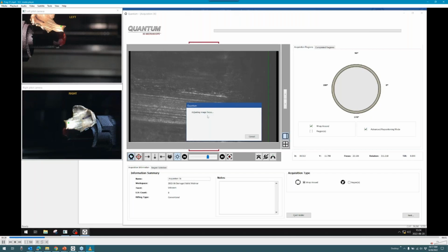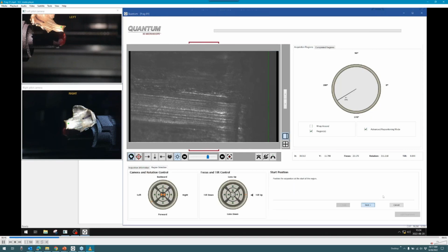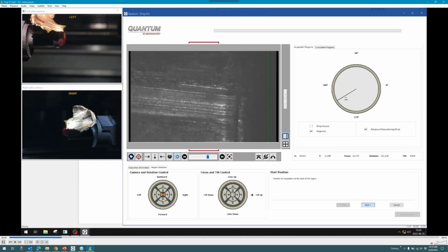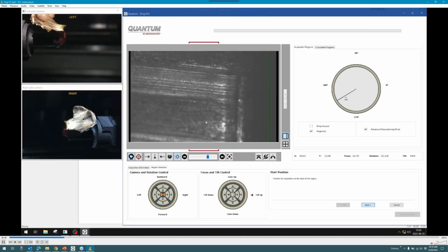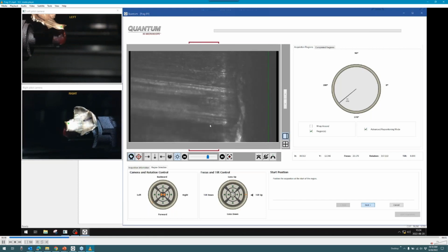It's adjusting the focus now, and I can see what appears to be the top shoulder where I've got the land impression filling up the lower portion of the photo box there. I rename it, and I call this a region acquisition. And now I have the tools available to me to find the center, rotate around the surface here to get comfortable with what's taking place.